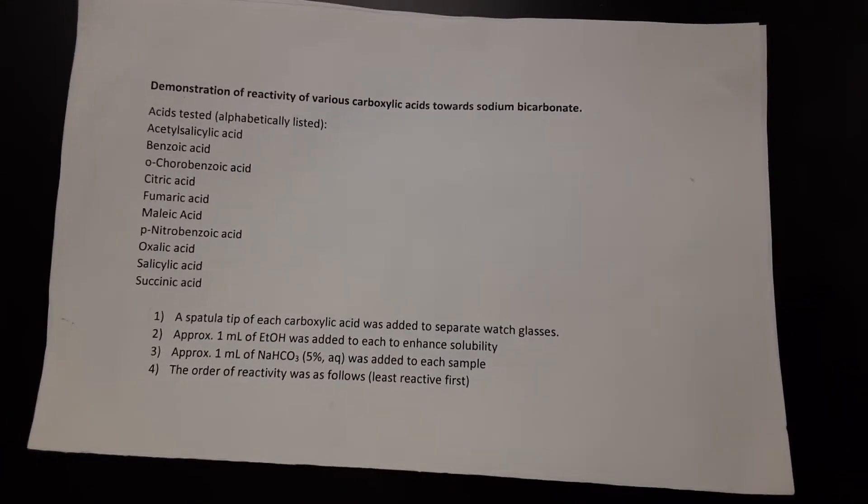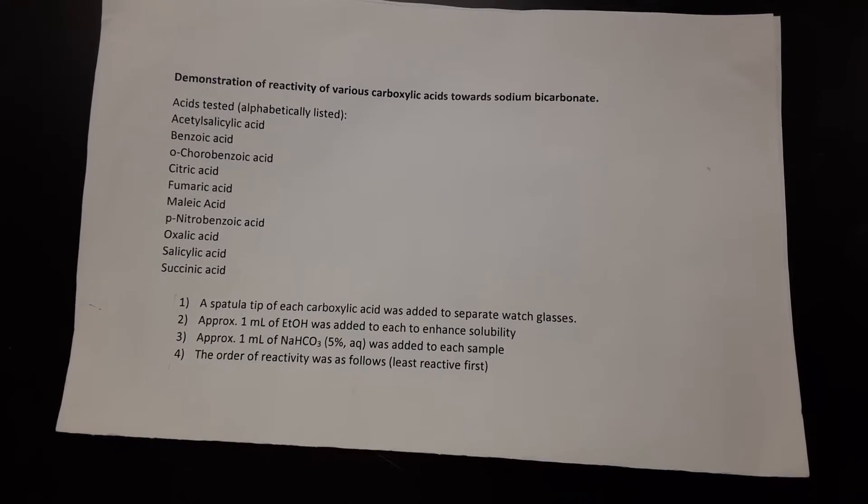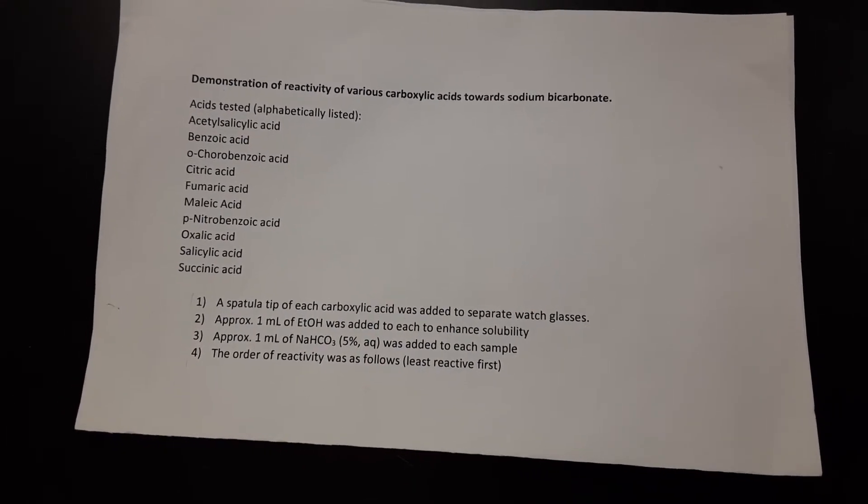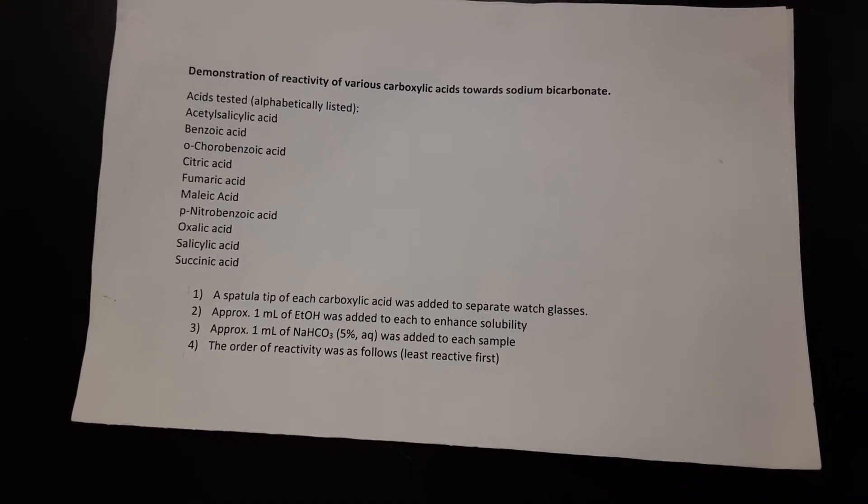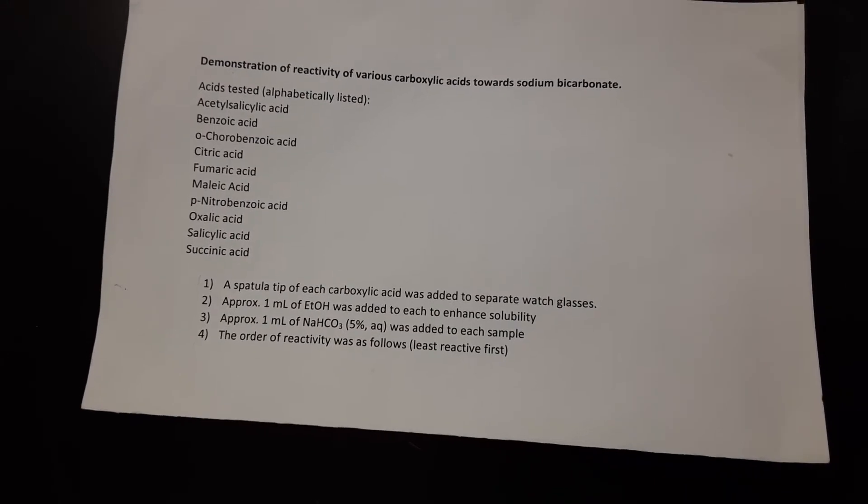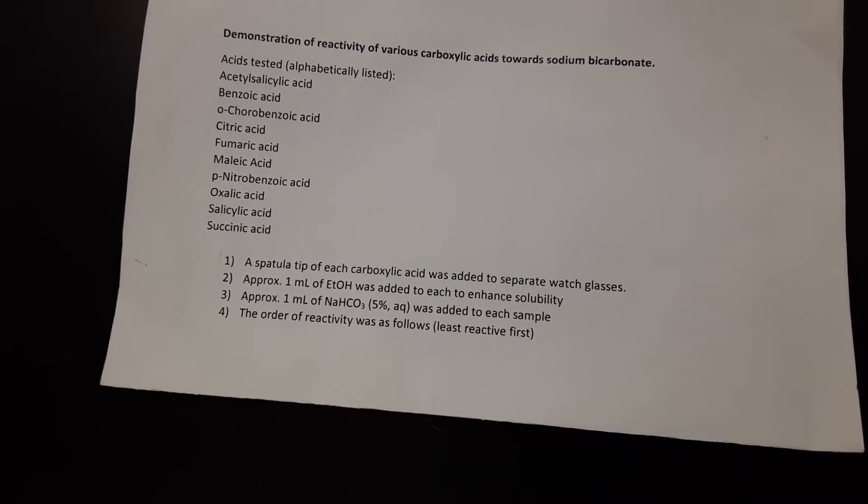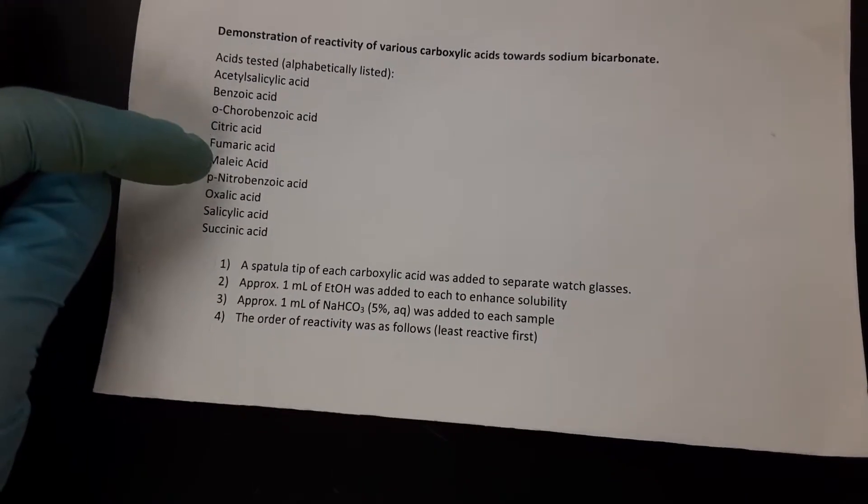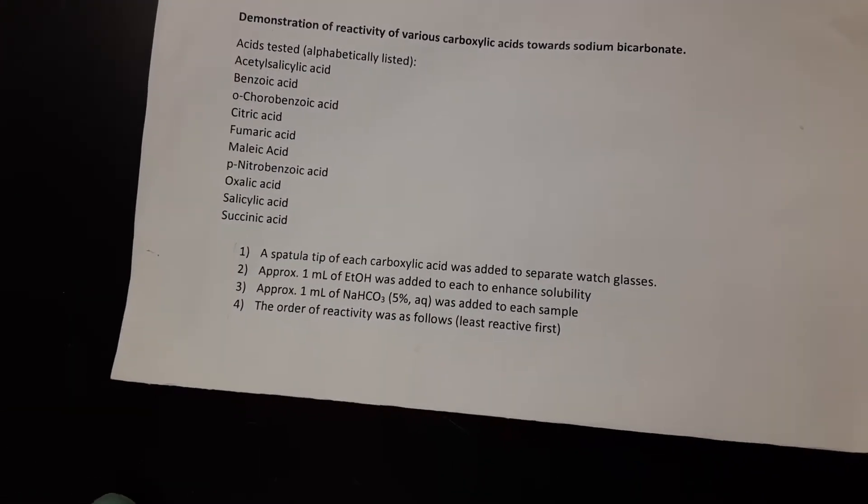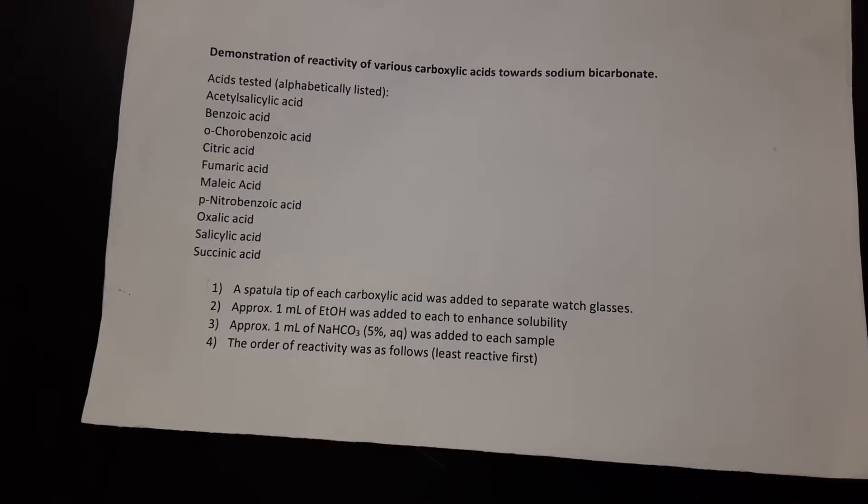In this video we're going to demonstrate the reactivity of various carboxylic acids towards sodium bicarbonate using this procedure illustrated. The acids are listed alphabetically and we will put them in order of increasing reactivity.